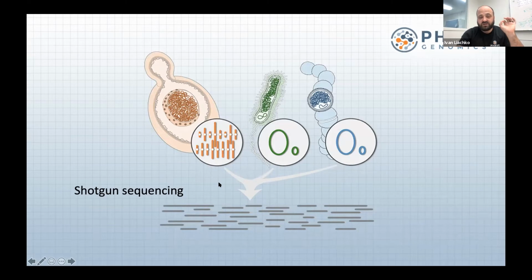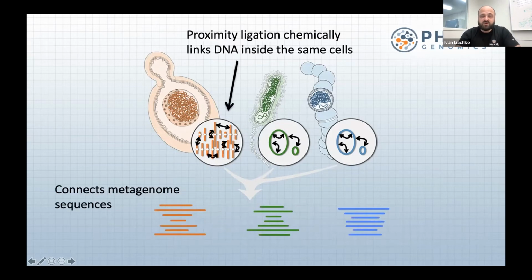And that's what we're addressing here, because if you do have Hi-C data, what it will do is it will create physical junctions inside of all these cells. And you will have intra as well as inter-chromosomal junctions. And you will know which contigs are touching each other, and you will know which contigs belong in the same genome. And if one of those contigs happens to be a plasmid, you will know who it's interacting with, which cell it's coming from. So you can actually do not just a metagenome deconvolution, you can actually track mobile elements in vivo directly in microbial communities without having to culture things.